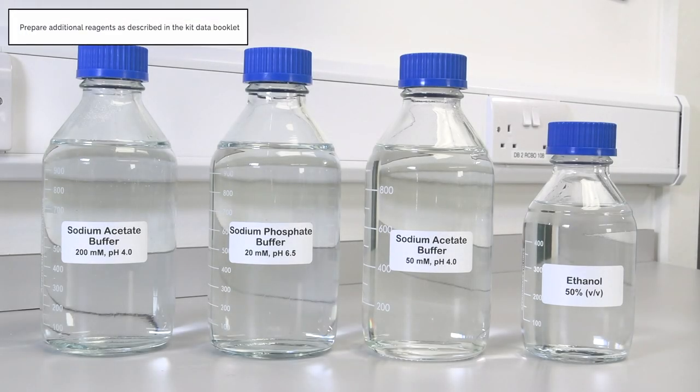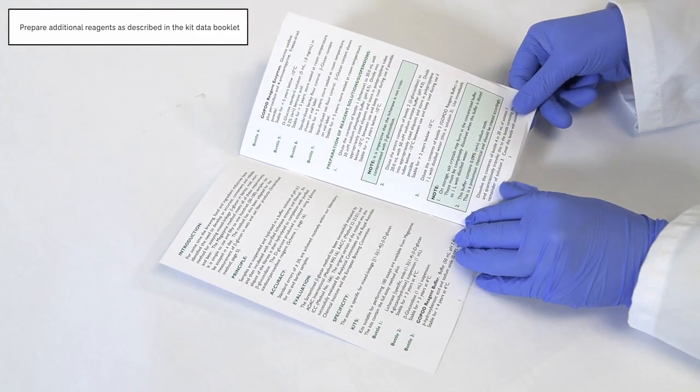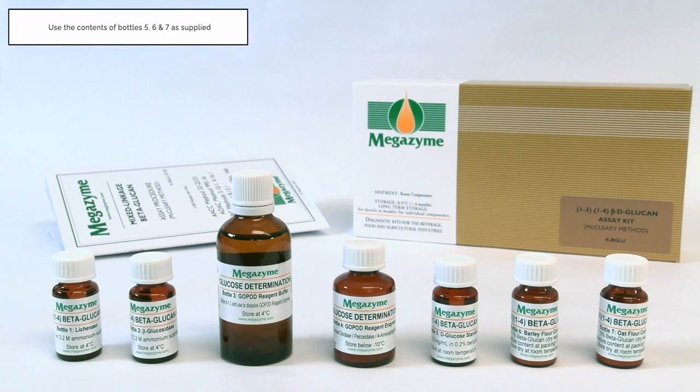Prior to sample analysis, prepare the required additional reagents as described in the kit data booklet. Subsequently, once all of the additional reagents have been made, the kit components should be prepared, and once prepared, they are ready for use in the assay procedure. Use the contents of bottles 5, 6 and 7 as supplied.